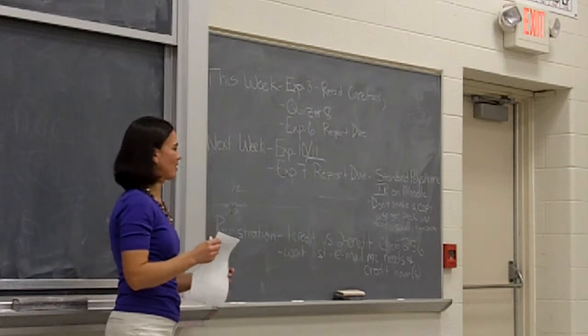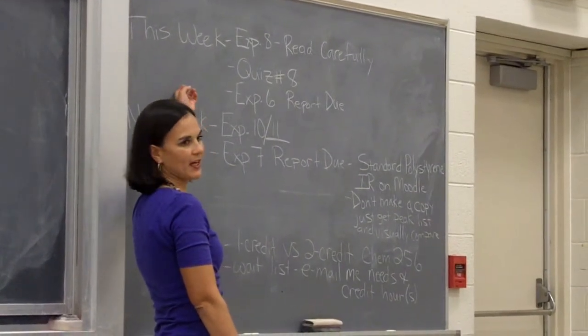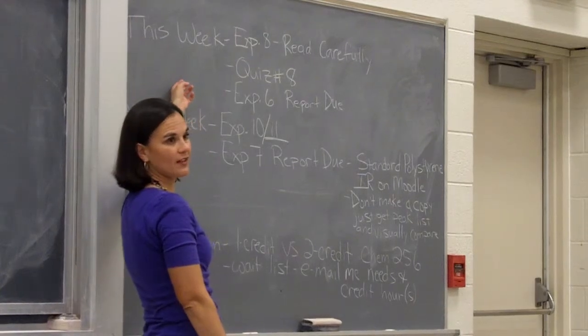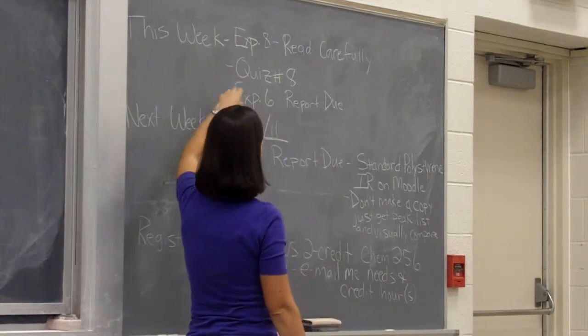Lots of things to talk about today. So this week in lab, we've already kind of previewed this a little bit. We will be doing experiment 8, your Grignard reaction. Lots of steps involved and things that you need to be very careful with. So make sure you read it very carefully and know what you're doing before you come to lab.